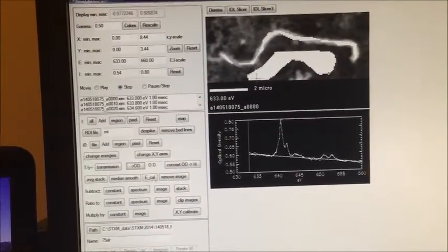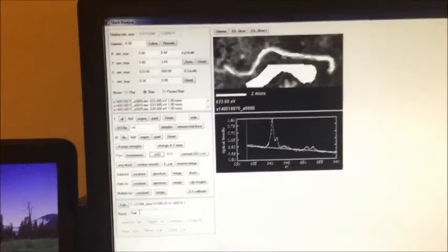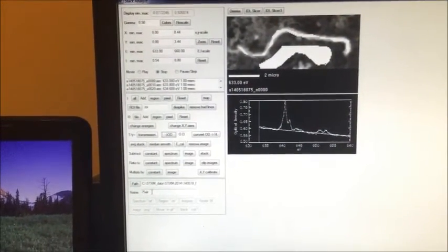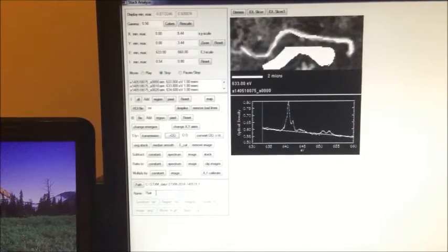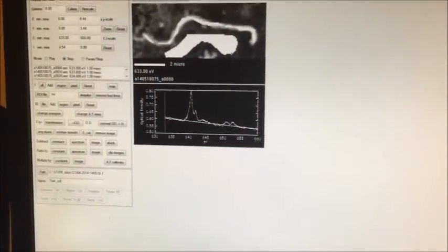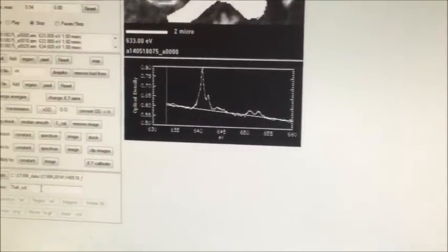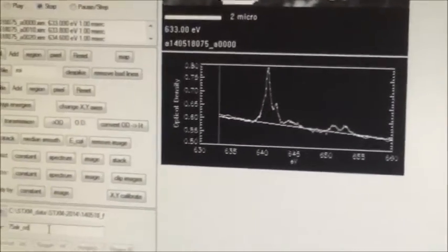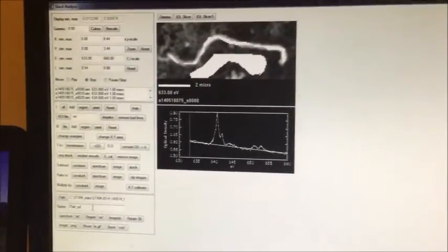So after this I'm going to save it. You can see here the file name which corresponds to the aligned stack 75 ALR. Now I'm going to save this optical density data. So you have to click on that, then just type OD, which corresponds to optical density. You can see here many tabs which are deactivated. I can activate them by just pressing enter on your keyboard. You can see it is activated now.